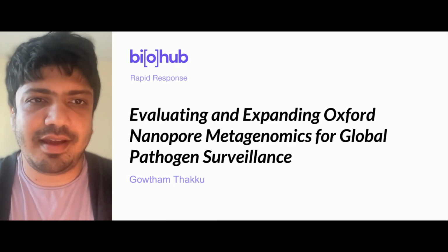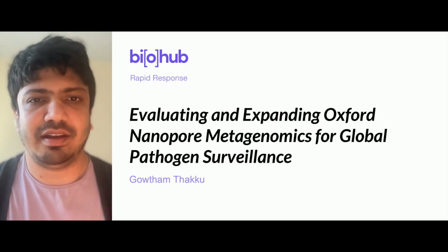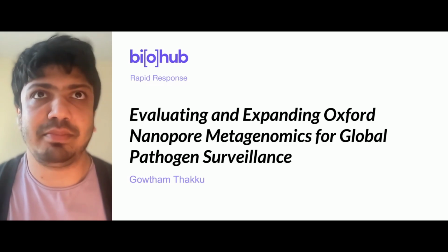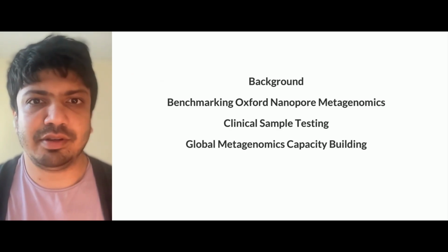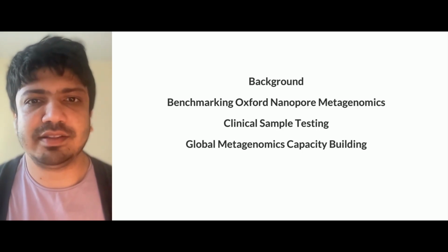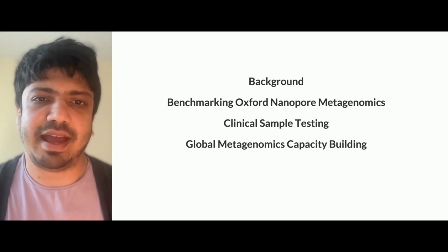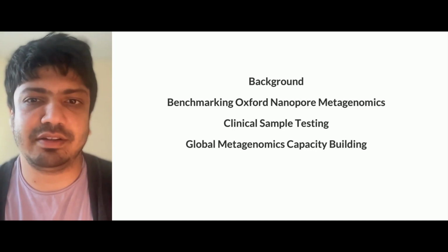Hi everyone. I'll be talking to you about our work using the Oxford Nanopore Metagenomics protocol, our work evaluating it, and then also expanding its use by doing trainings across the globe. So this is a quick agenda. I'll go through a little bit of background and then discuss our results benchmarking the protocol, and then also a little bit of our experience testing clinical samples. And finally, I'll share a few words on our work doing capacity building globally.